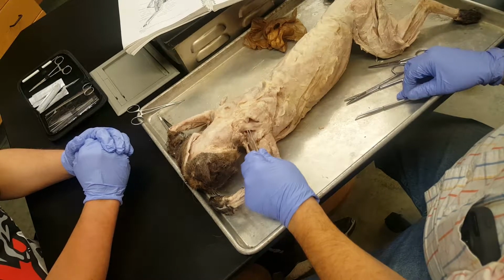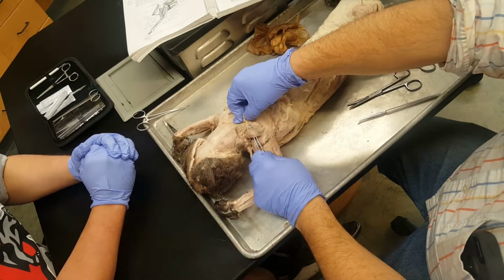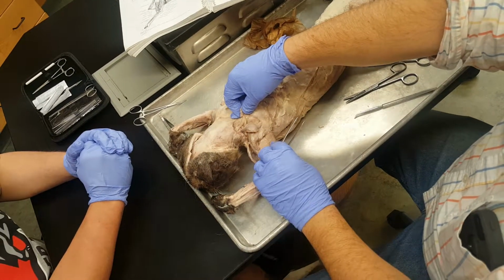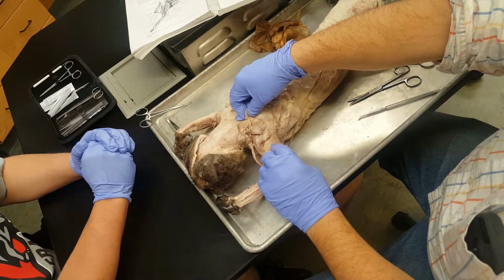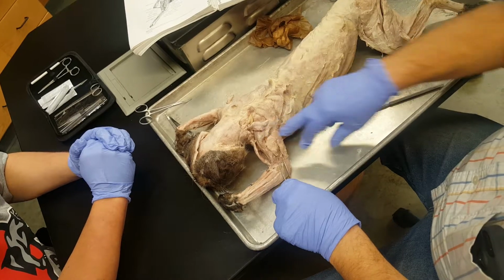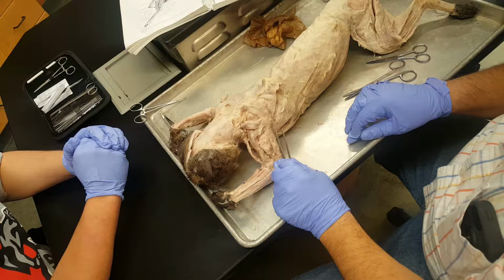This is the omotransversarius. What does omo mean? Omo means shoulder. This is going transversely over the shoulder, hence the name omotransversarius. Okay? And this is the brachialis. Brachium means arm. So that's your brachialis. And then these three are the triceps brachii.